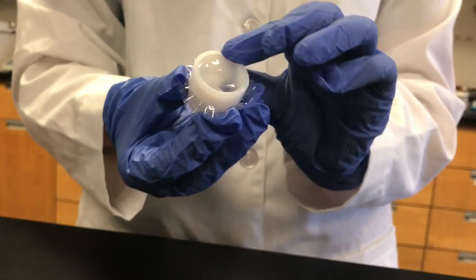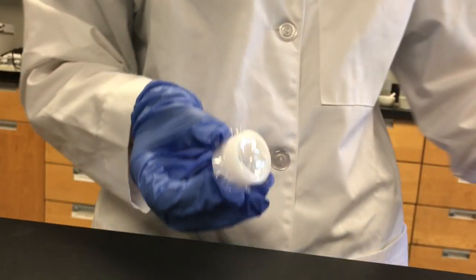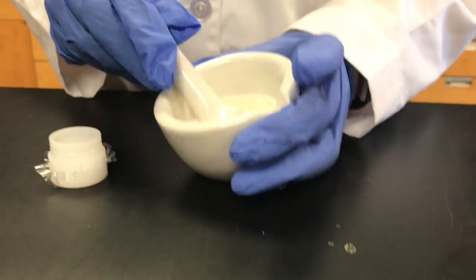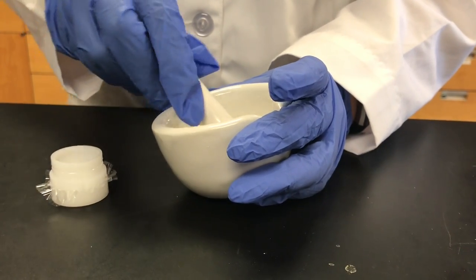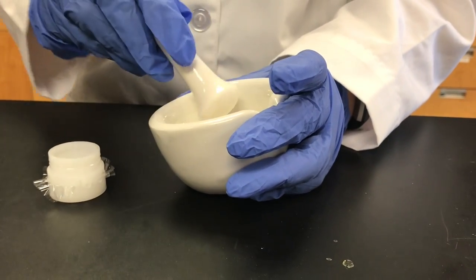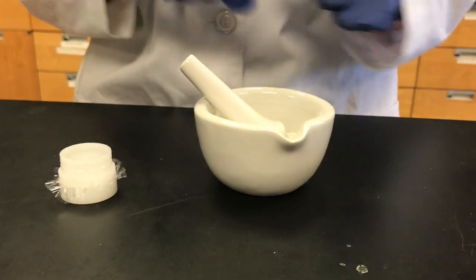Now once you have it ready, it should look like this. It should look better than this, but what you're going to want to do is put all of your sample of the zinc gluconate and the lozenge mixture into here. So we're going to do that now.